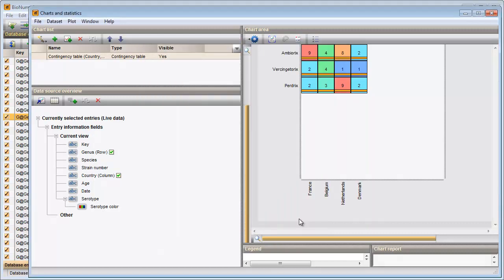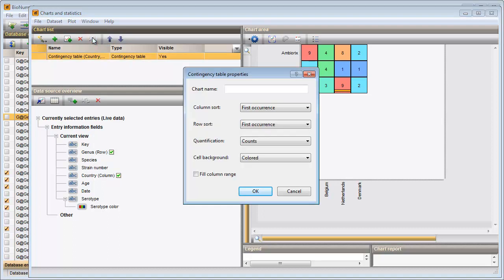The cells are colored based on the member counts: blue for only one member, going over green and orange to red containing the highest number of members. Pressing F4 unselects all entries. To select all entries contained in a cell, hold the Ctrl key and click on a cell. Changing the order of the rows and/or columns can be done in the Properties dialog. As an example I will sort my columns alphabetically.